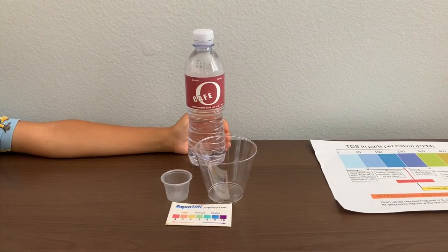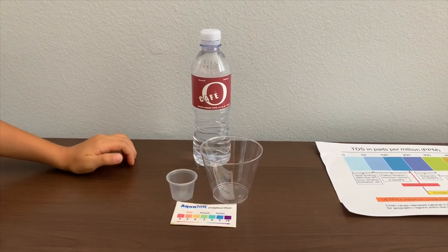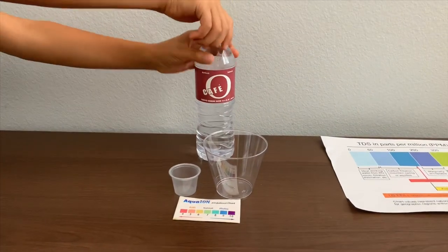This is OCAFE purified water sourced from local municipal sources. Let's test the TDS and pH levels.